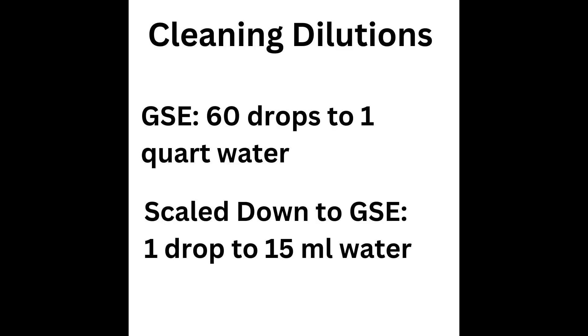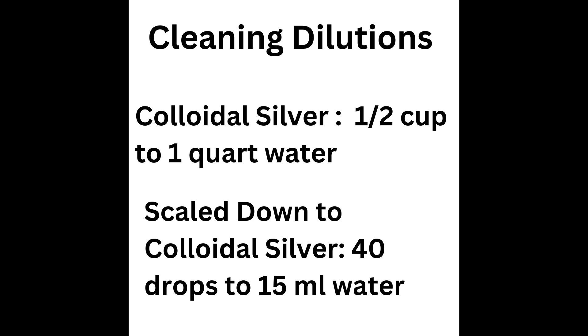What I'll do is I'll take some sterile swabs and a petri dish and I'm going to swab my kitchen sink and my toilet bowl. I'm going to smear the bacteria all over the entire dish. Then I'm going to place a drop of the grapefruit seed extract diluted to what would be a cleaning solution, the organic grapefruit seed extract diluted like it would be used in a cleaning spray, and also the colloidal silver diluted like it would be used in a cleaning spray.